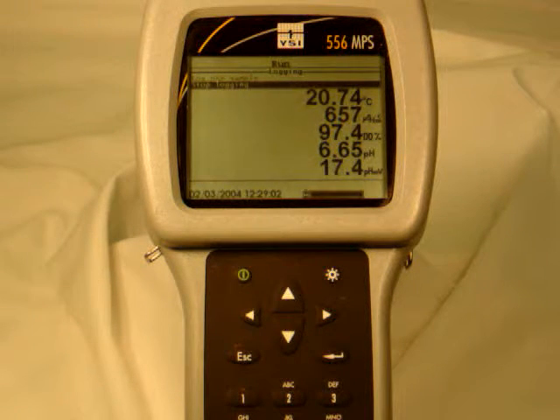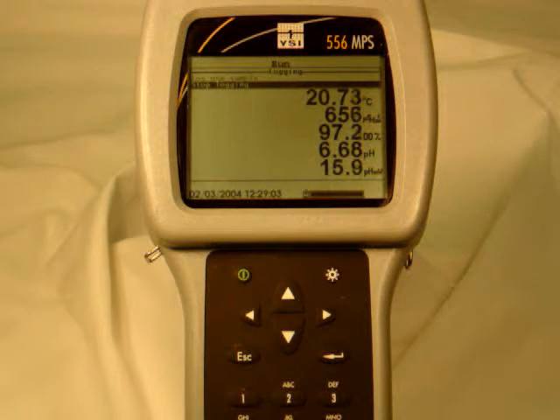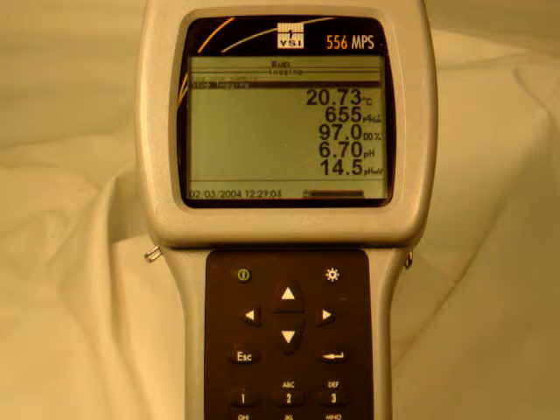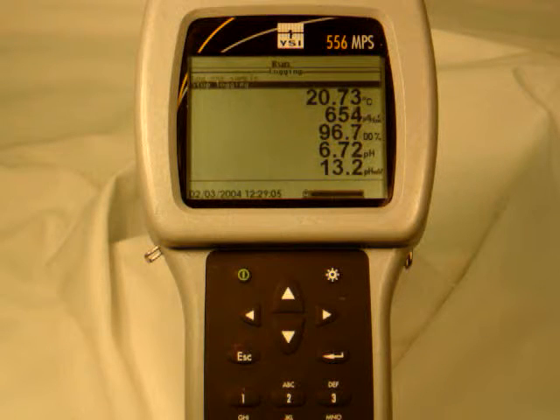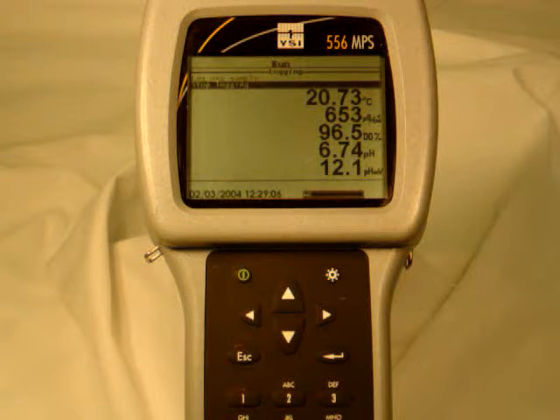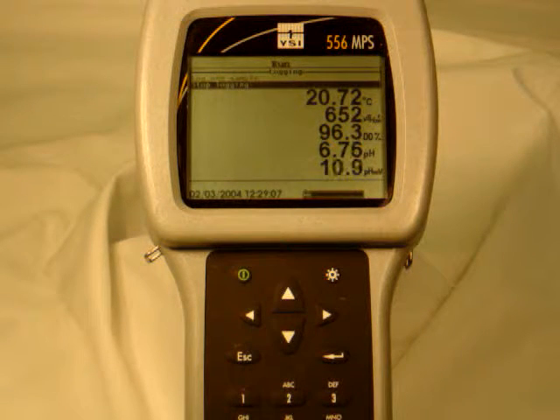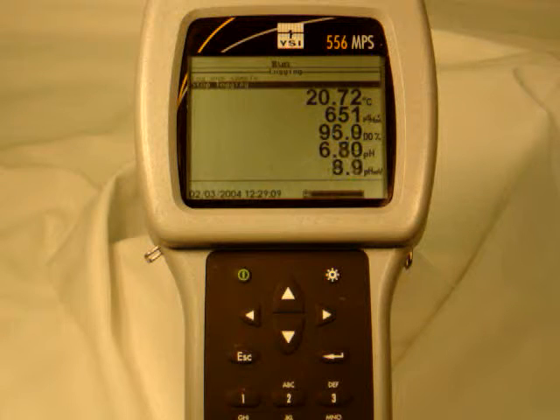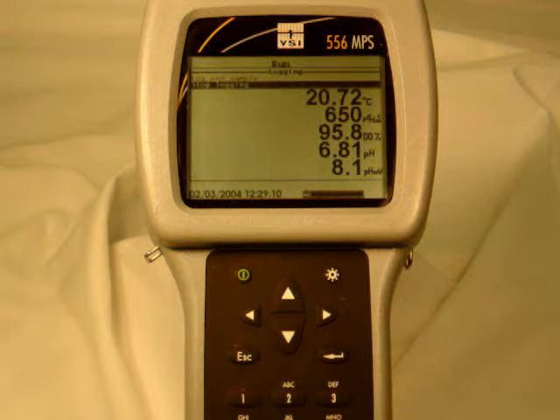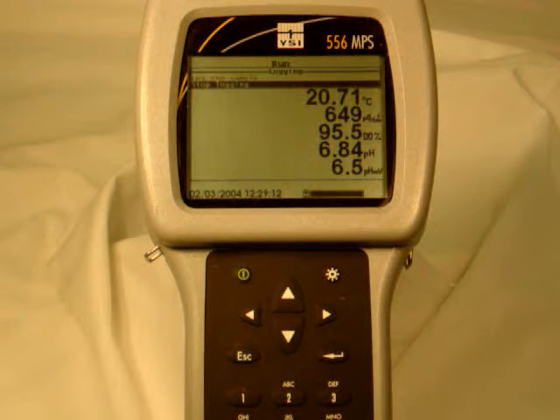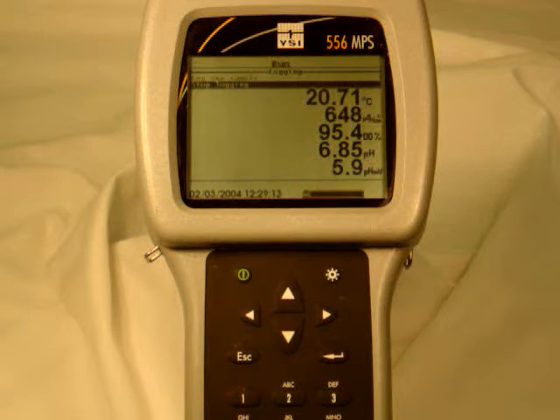It's actually quite a nice response now. Have you noticed that? The first time it was quite slow, and now this time I just got used to it. How can that make a difference when you put it back in the four in between the two tests? This hasn't got a memory, has it?